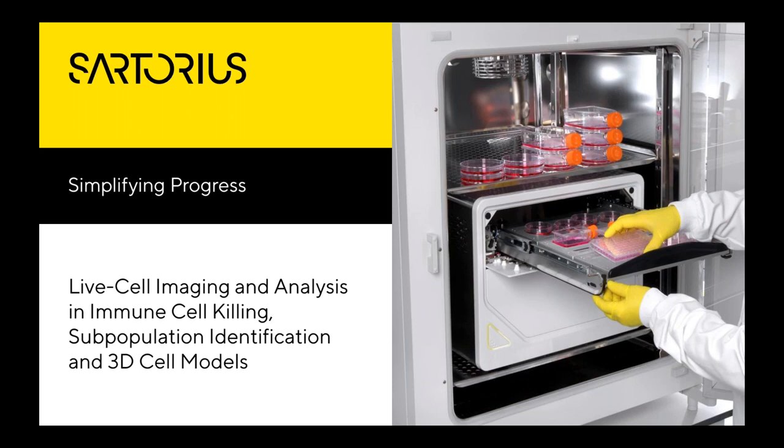Today we are going to talk about three broad areas of interest in the field of live cell analysis, namely immune cell killing, subpopulation identification, and 3D cell models.